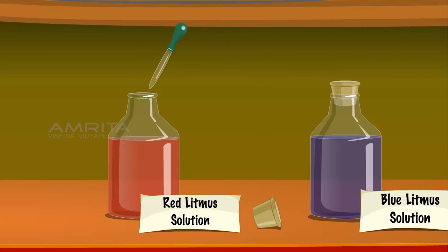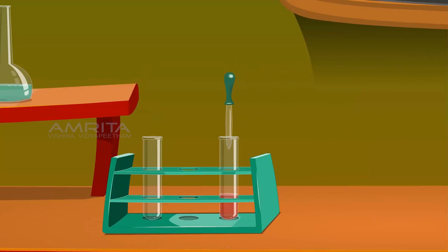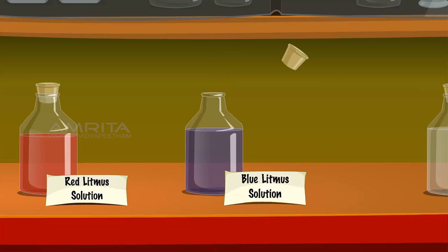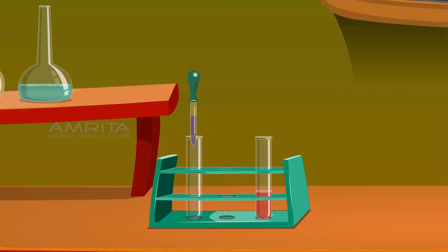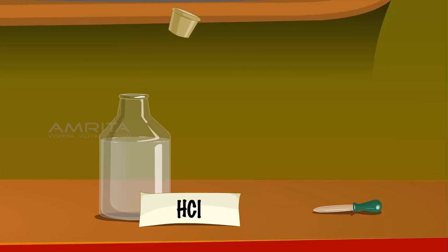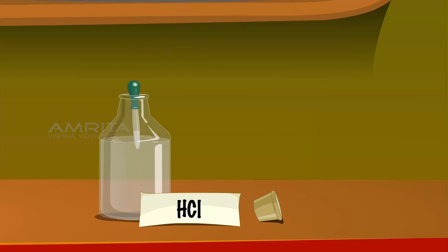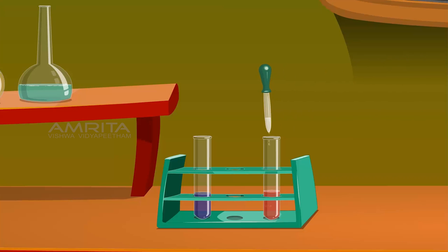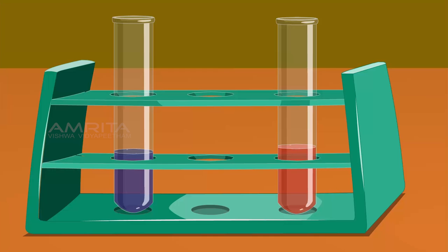Take the red litmus solution and pour it into a test tube. Take the blue litmus solution and pour it into another test tube. Take a few drops of HCl solution from its bottle using a dropper and add this to the test tube containing the red litmus solution. The colour of the solution remains the same.